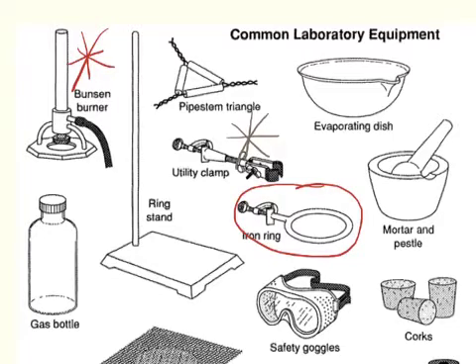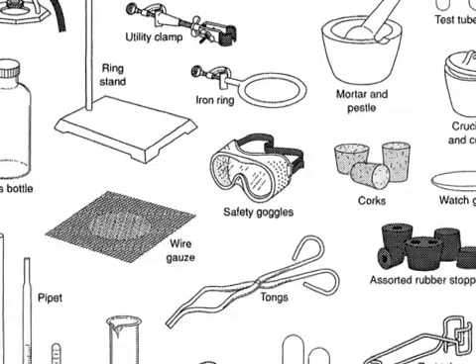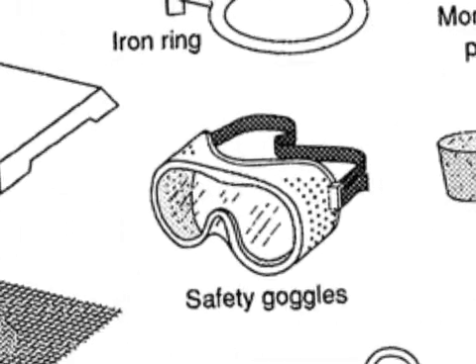This nice little tool right here is a utility clamp. We can have all kinds of things on the end of it, but mostly the end of it will be holding test tubes, because that is what we're going to be using the most in our reactions. Next up is safety goggles. Safety goggles are used to protect your eyes. They're not used to protect your forehead or your throat. We will talk more about safety goggles later.